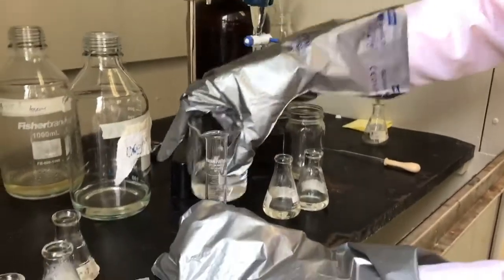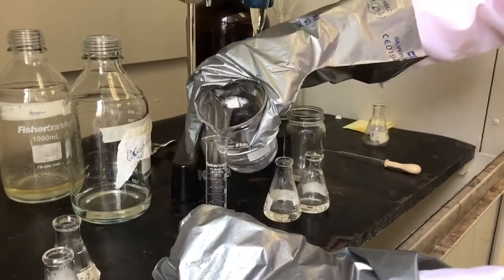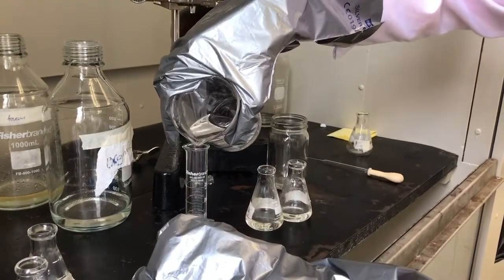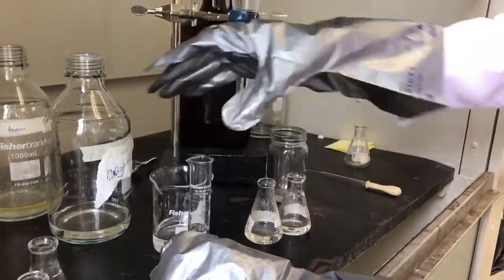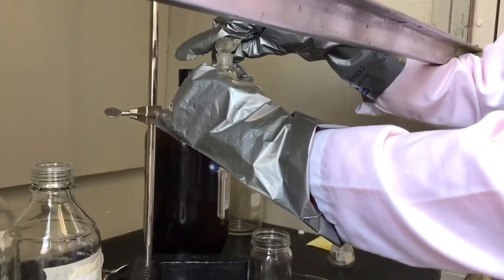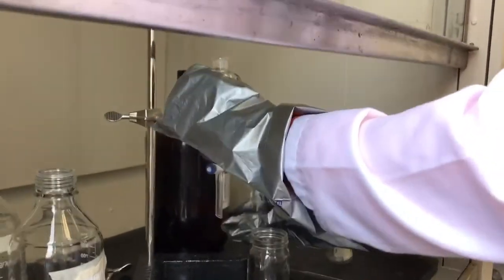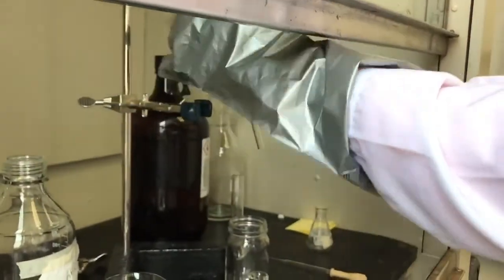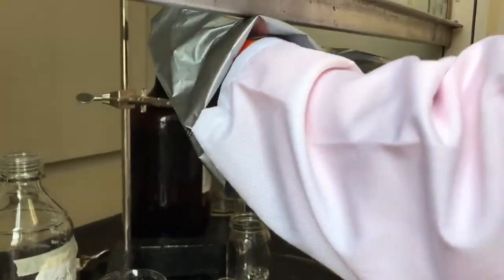Be sure to wear silver shield gloves as dichloromethane is quite hazardous. Once we've brought DCM to the party, it's time to invert the separatory funnel.